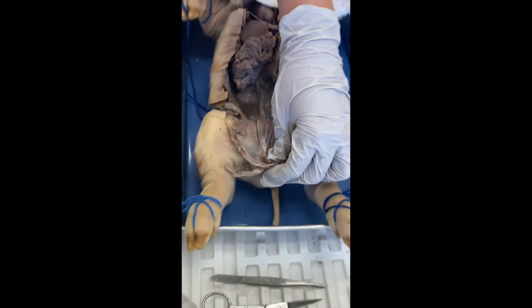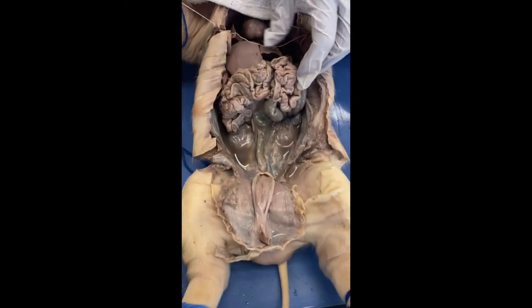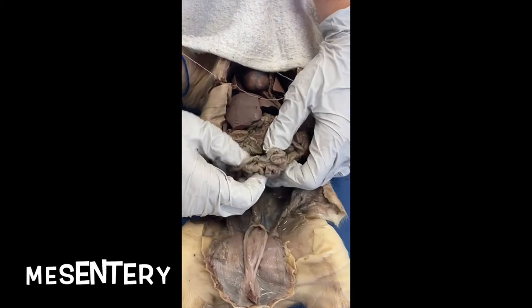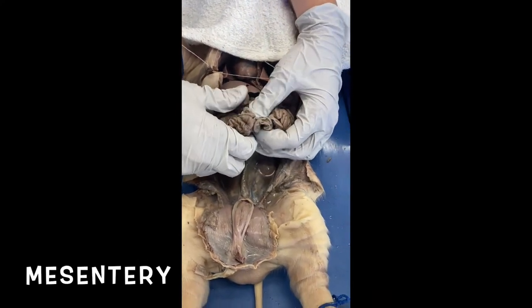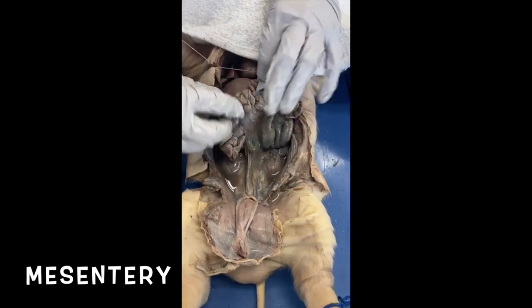Let me check my list. Fleming, are we? No, I did not show mesentery. Let's go back. Mesentery. How could we forget the mesentery? It's the prettiest part. If you were an artist, this is the most attractive part of the insides. It's the flower.